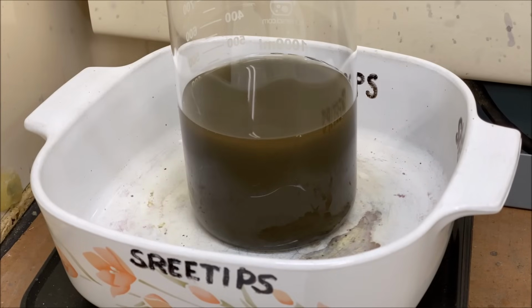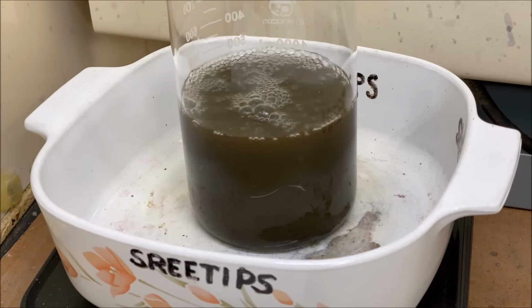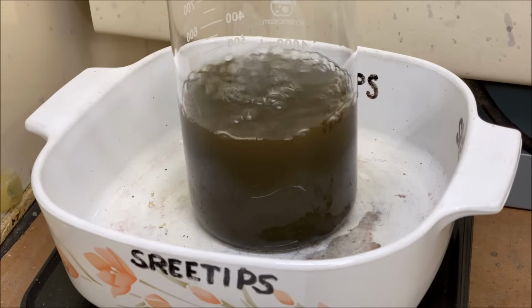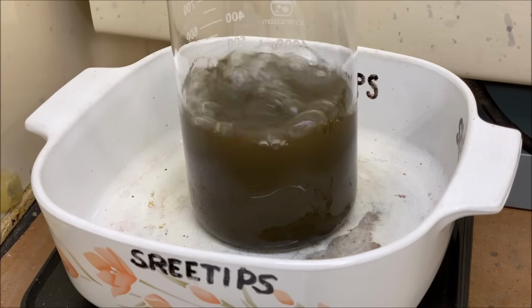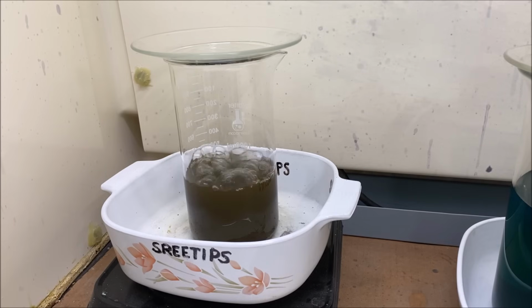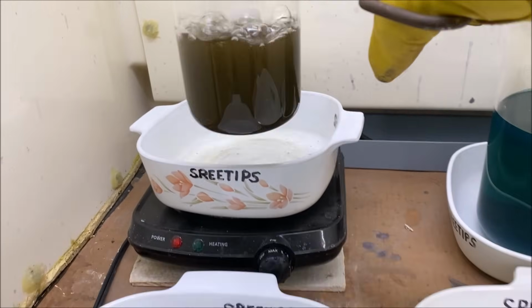When the solution is dirty like this, the gold likes to stay suspended. What I mean by dirty is there's probably some platinum group metals in solution in there, and that causes the gold to not want to settle out too well, even if we boil it. Now we'll pull this down off the heat and let it cool down a little bit.